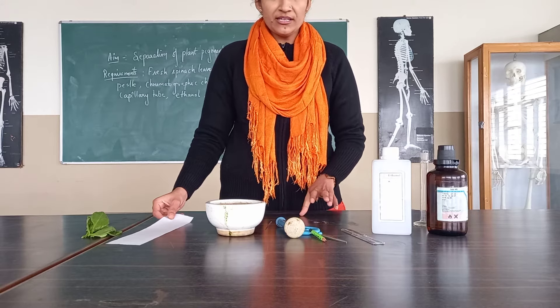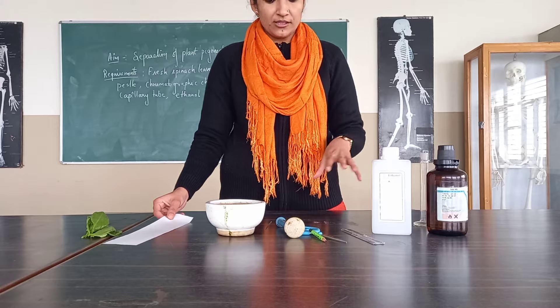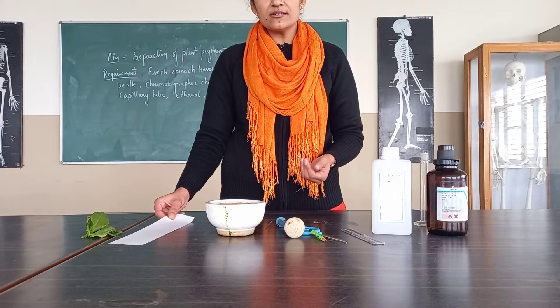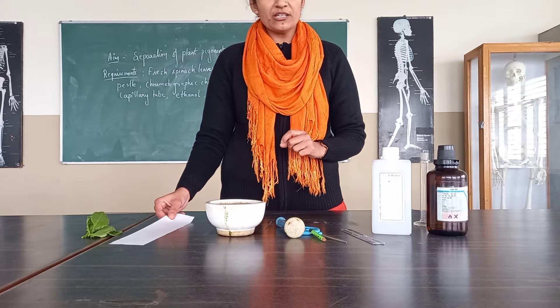Paper chromatography is a convenient method — it is the fastest way, the use of material is very less, and we will be getting the results fast also. So we will use paper chromatography to separate the components.